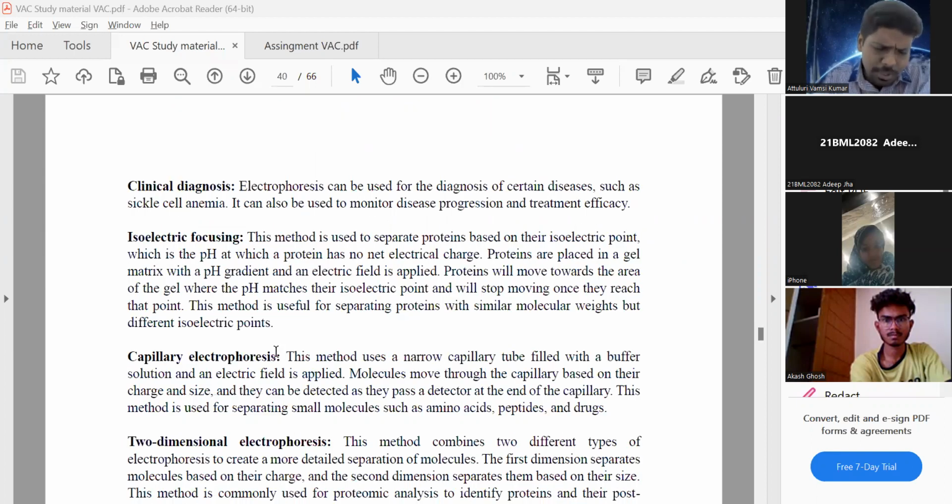So there is a plethora of applications of electrophoresis. Some include clinical diagnosis, where whatever molecule is suspected to be pathogenic can be detected in the labs. We can do research, food molecules, environmental studies, forensic studies, cancer studies, even hormones can be separated. That depends upon the modification of the gel and the type of casting we are using. Okay, so that is all about the electrophoresis.